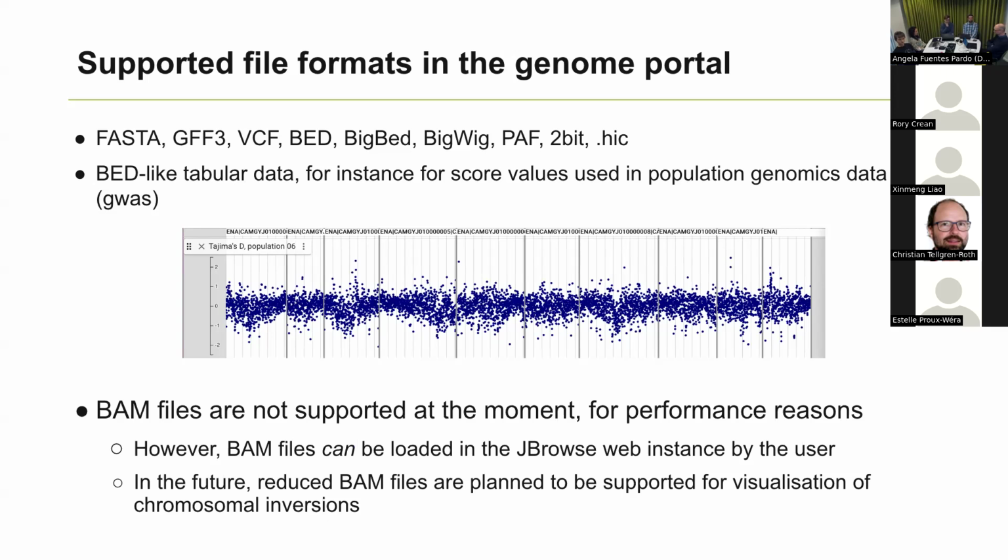We have put a little caveat here right now that we have seen that BAM files do negatively affect performance, especially on our web server. So right now we are not putting any BAM files up on our genome portal, but that doesn't mean that you cannot use them as a user.